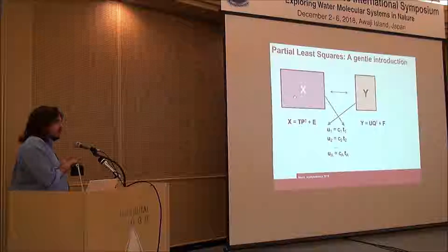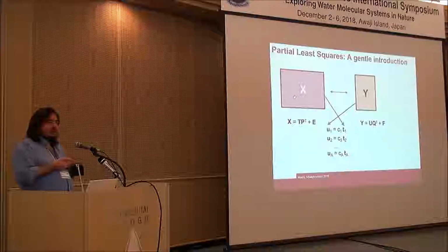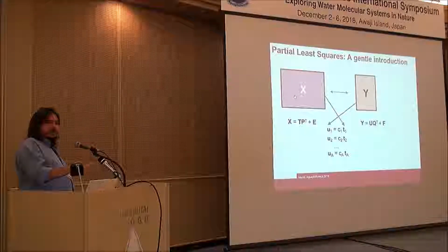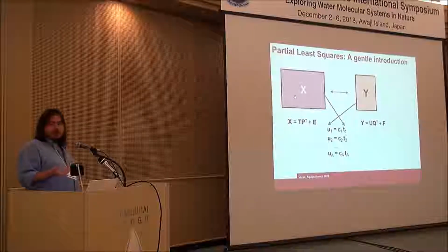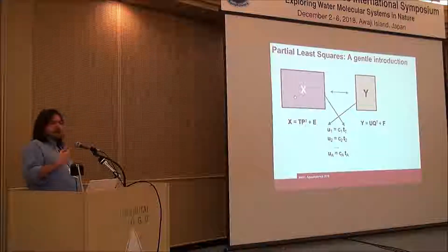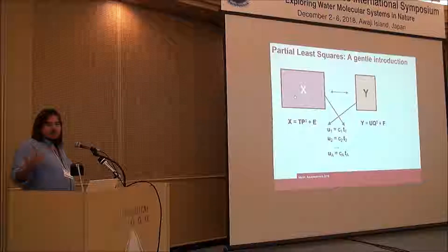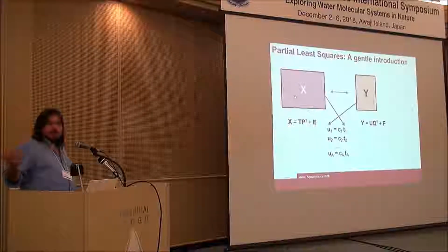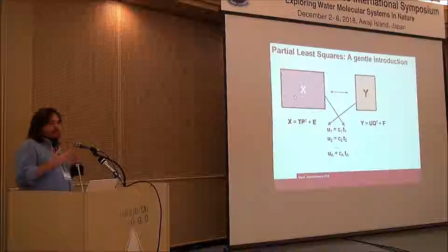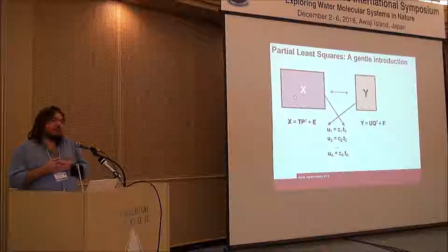The idea is that we need to use a parsimonious description of our data as predictors for the property or properties that we want to measure. This is because we have technical problems: we cannot calculate regression models on a few objects when we have a lot of variables. But also because we would ideally like to have an idea of what the meaningful sources of variation in our data are, just as we do with PCA.